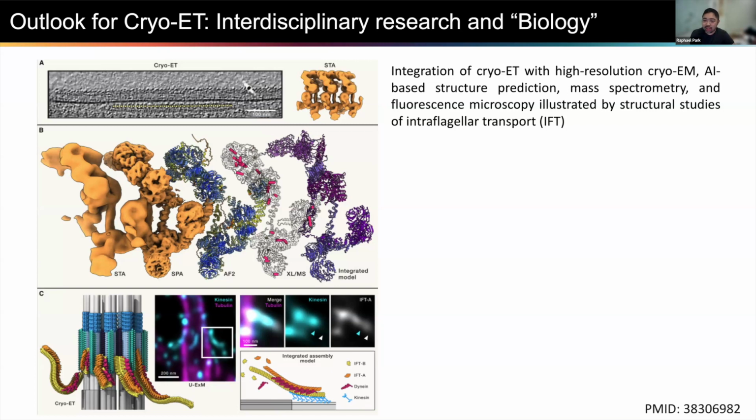So going back to biology, characterizing your image using multiple different methods, like even going back to genetics, imaging, and all kinds of biophysical assays, is really fundamental to doing good cryo-ET work. So I would say the key to cryo-ET and the future of cryo-ET is really more biology. With that, that's my last slide. Thank you.